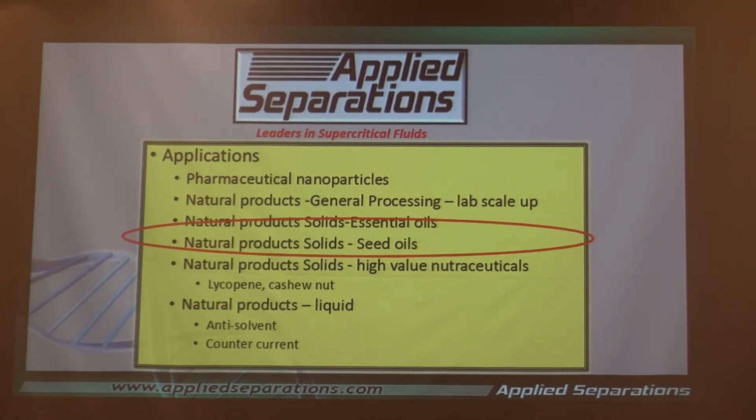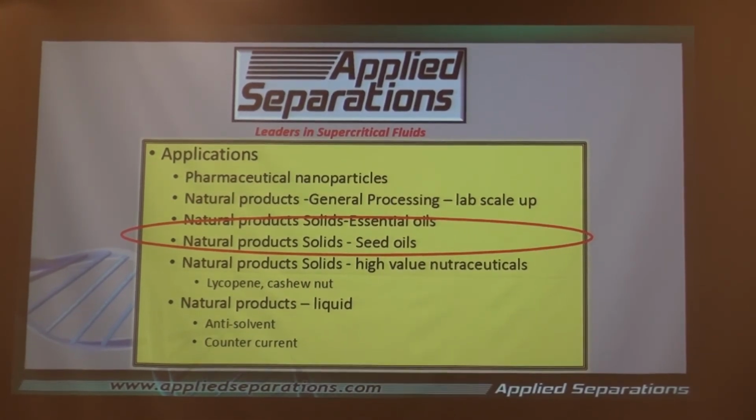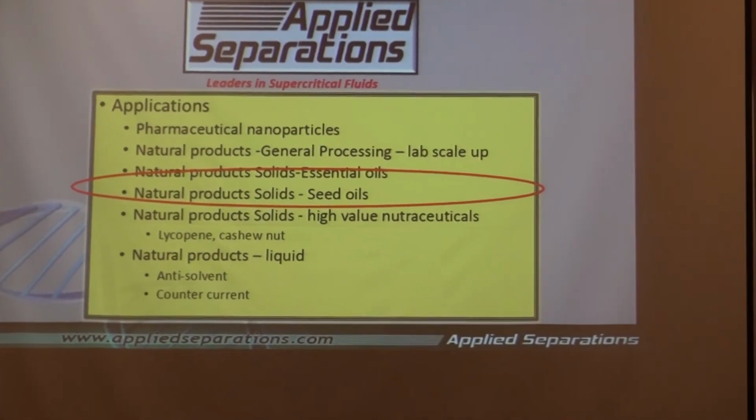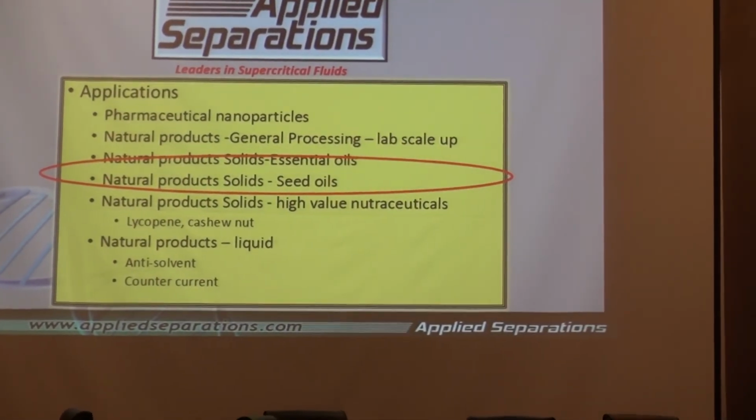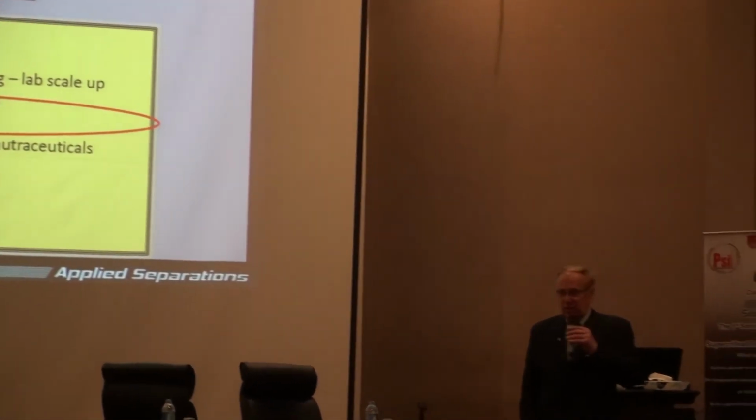Instead of waiting to the end, does anyone have any questions on the essential oils and the fact that you don't have to stay with supercritical? You can go all the way to liquid as well. There's no reason to limit yourself. I'm just trying to give you opportunities that you can go many different ways, using solubility in the supercritical state, but also in the liquid state.